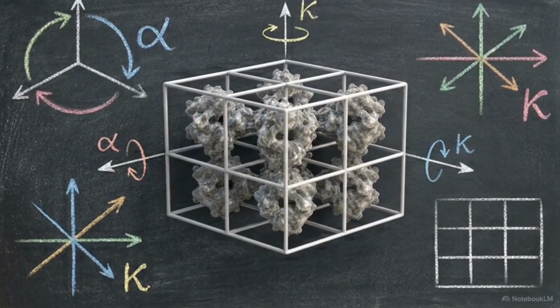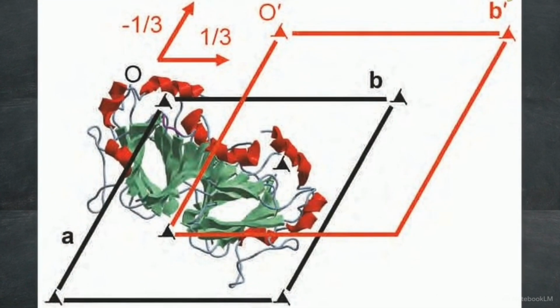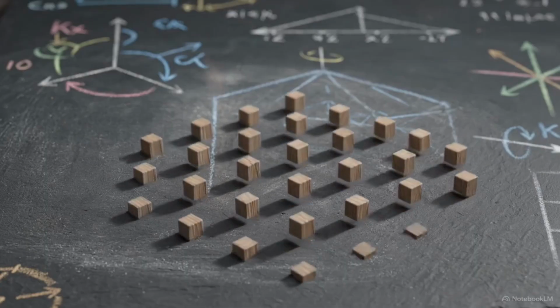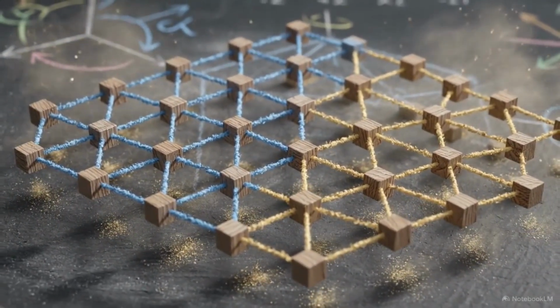Look at this structure in a trigonal cell. Deorthogonalizing the operator tests if the local rotation axis aligns mathematically with the fractional lattice. Shifting the origin locks this symmetry into the cell's face. It's a true crystallographic axis, redefining the entire space group. The geometry of a biological molecule leaves a strict mathematical imprint on its crystal. By decoding the signatures hidden in unphased reciprocal space, we map those structural relationships and uncover the foundational rules holding the lattice together.